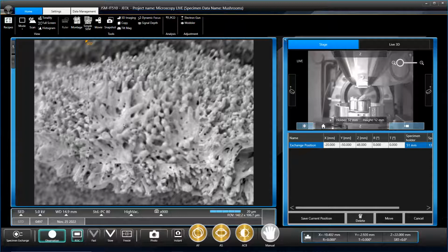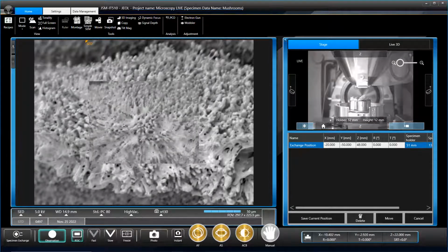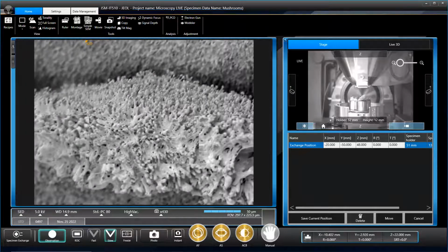Let's just explain whilst we're doing this. The important thing about electron microscopy is keeping the beam in focus. Much like with a camera, if you want to take a nice photo, you want everything in focus. The benefit of secondary electron imaging is you can be a little bit arty with it. You can focus on things in the background, or things in the foreground, and you can get some really nice images. This is not one of those nice images. I have done a terrible job.